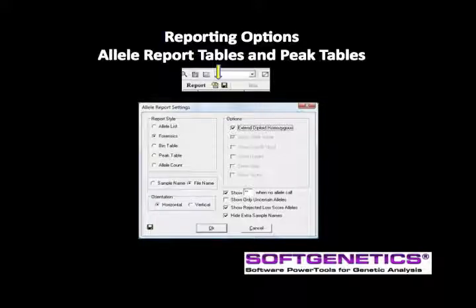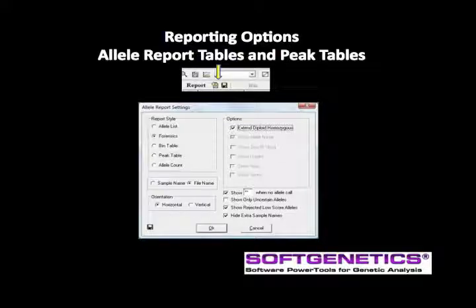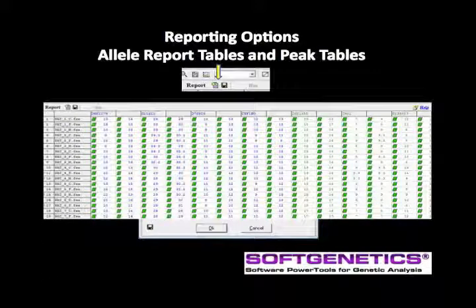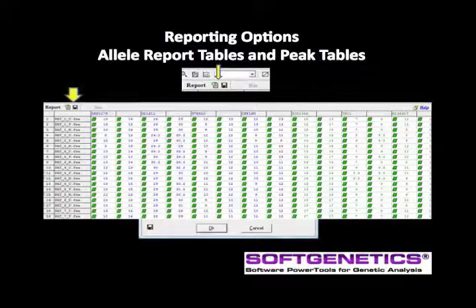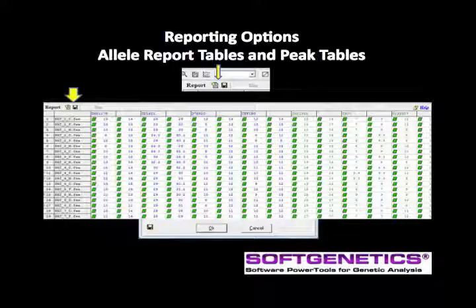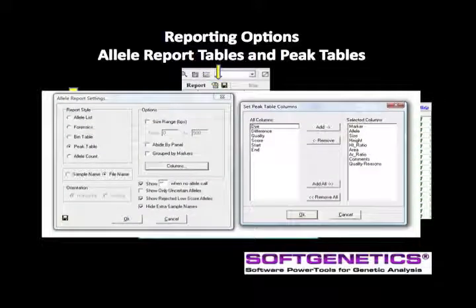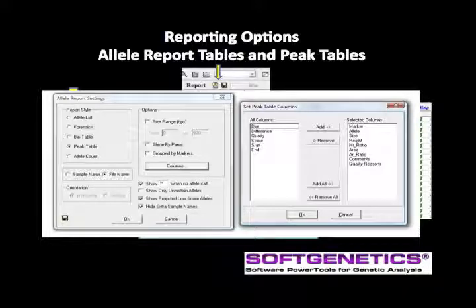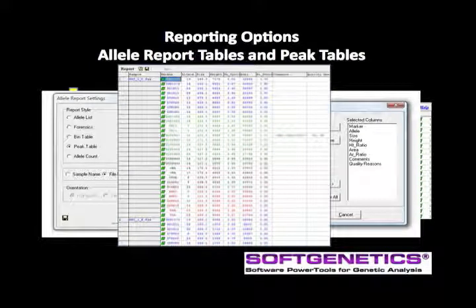Reporting options also include allele report tables and peak tables. Activate the allele report setting using the report icon in the upper right side of the main analysis window. Select from report style and other options to customize the report for your lab's preference. These report settings result in an allele report listing the file name, loci, and allele calls. Use the save icon to save the table as an XLS or text file. Another commonly used format is the peak table, where the analyst may select from a list of column headings to include in the report table.